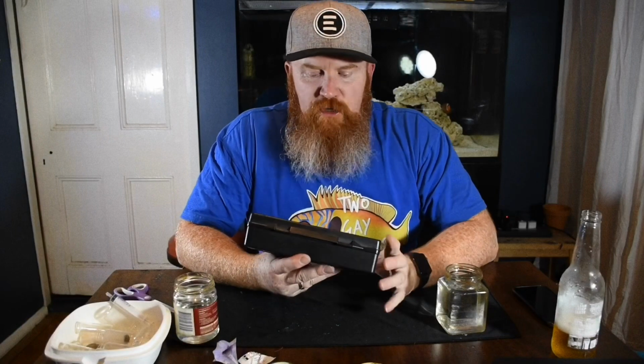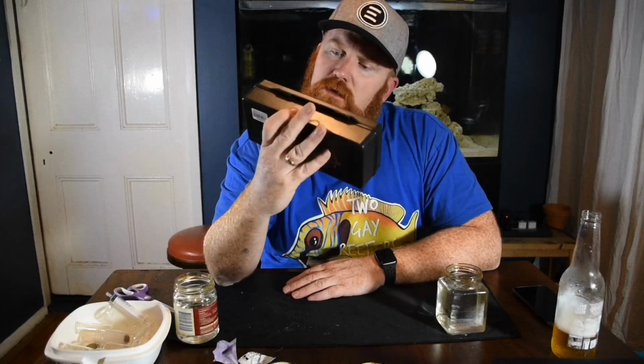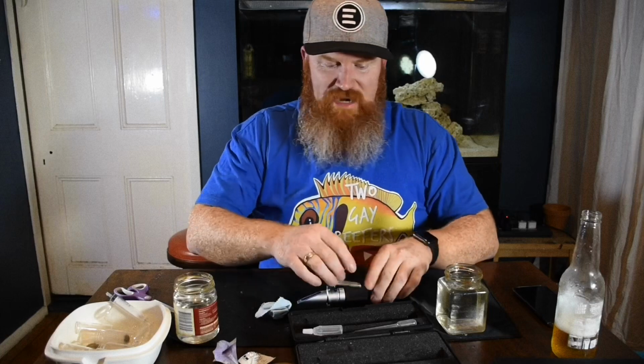Alrighty, last but definitely not least is to check your salinity. Always a good idea to keep an eye on your salinity so you know exactly where things are sitting. So we use natural salt water. We did a water change yesterday morning. This is our first test since then. We use this salinity refractometer. I really like it. I really do. It works really well.